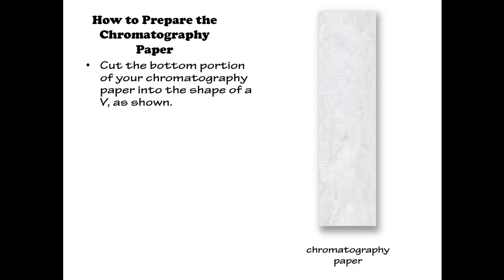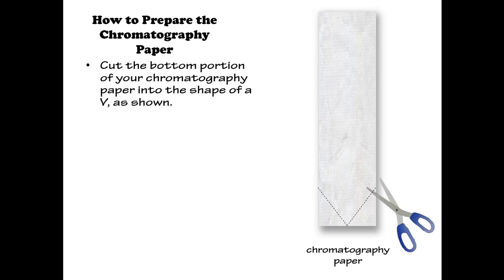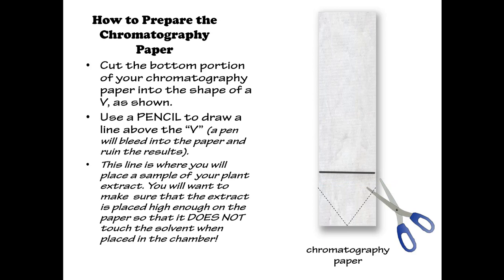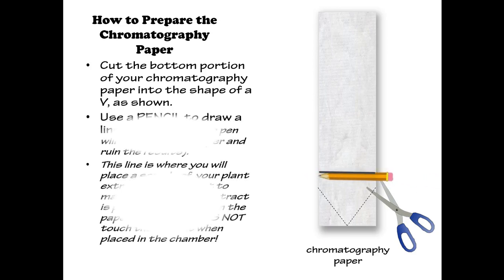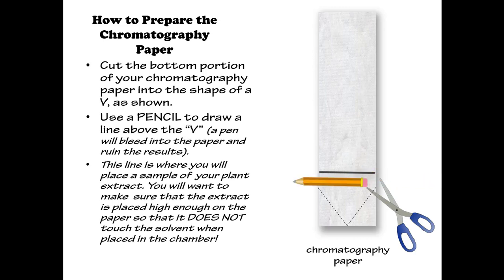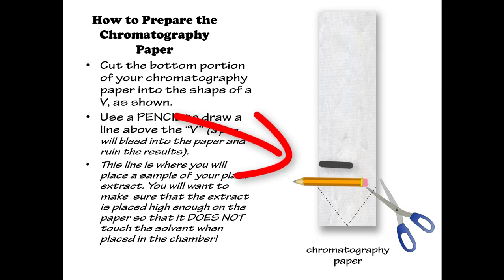Prepare your chromatography paper by cutting the bottom portion into the shape of a V. Next, use a pencil to draw a line above the V — don't use a pen because a pen will bleed into the paper and ruin your results. This line is where you will place your sample of plant extract. Make sure the extract is placed high enough on the paper so that it does not touch the solvent when placed in the chamber.